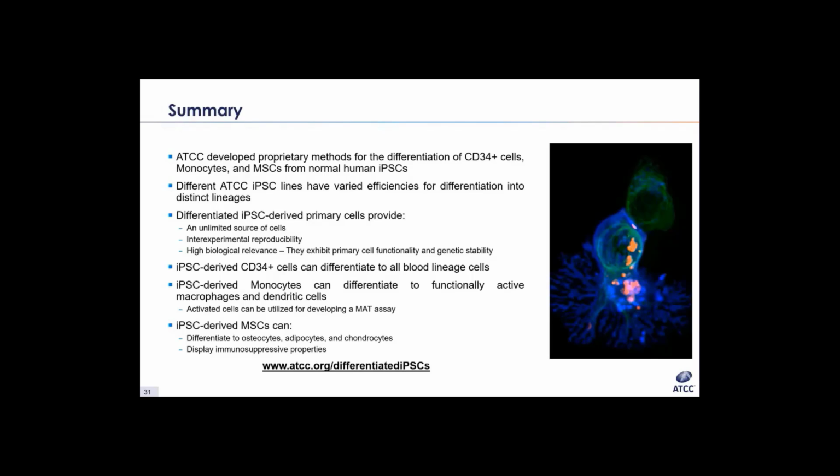All right. For our next question, if we generate our own protein constructs that have our own generated mutation, how do we transfect iPSCs or differentiated cells with our constructs? So presumably these cells are transfectable. The parental cell lines are.